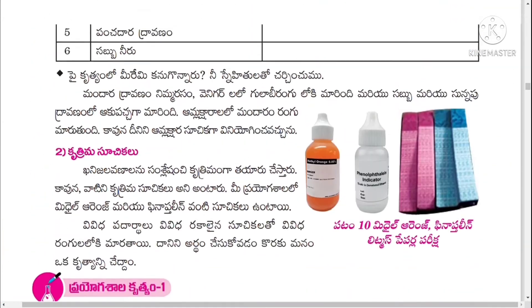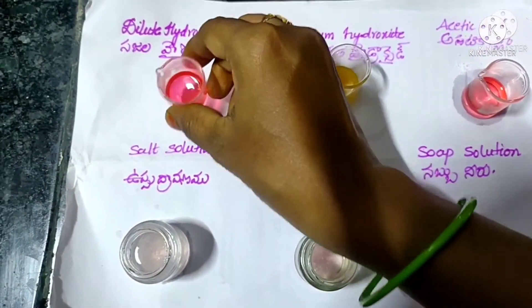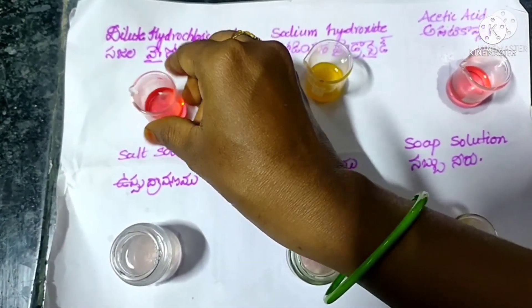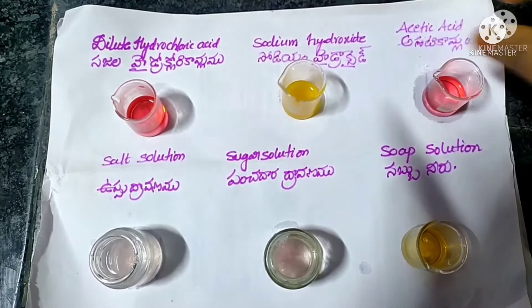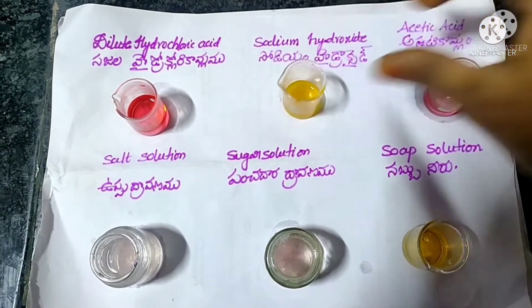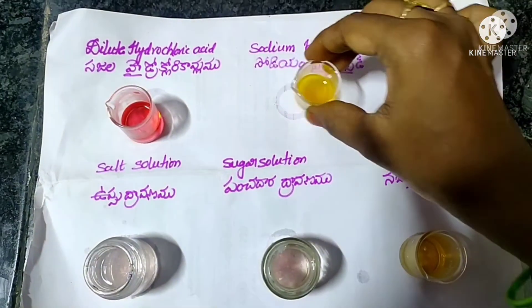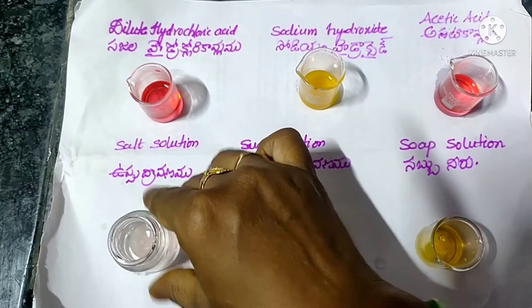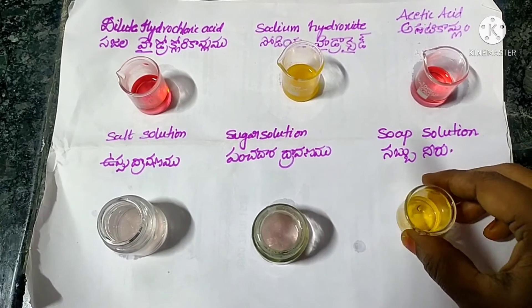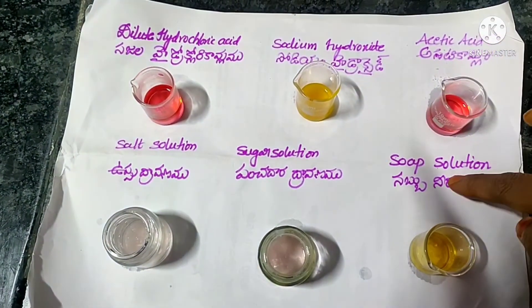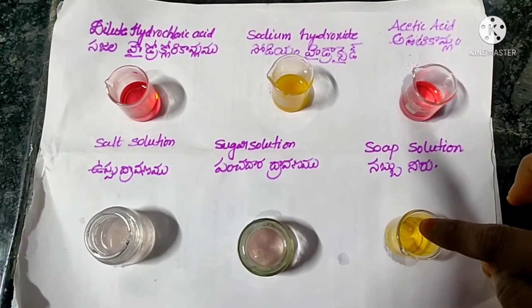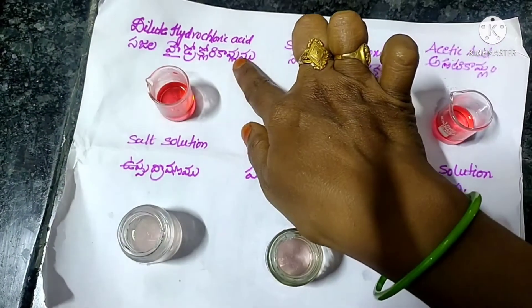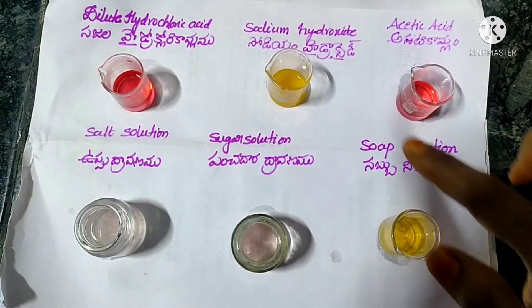The next indicator is methyl orange. Add two drops of methyl orange to dilute hydrochloric acid solution — the acidic solution will turn red. Add few drops of methyl orange to sodium hydroxide — it will turn yellow. Add few drops of methyl orange to acetic acid solution — it will turn red. Add few drops of methyl orange to salt solution and sugar solution — it does not change any color. Add few drops of methyl orange to soap solution — it will turn yellow. So methyl orange turns red in acids and yellow in bases.